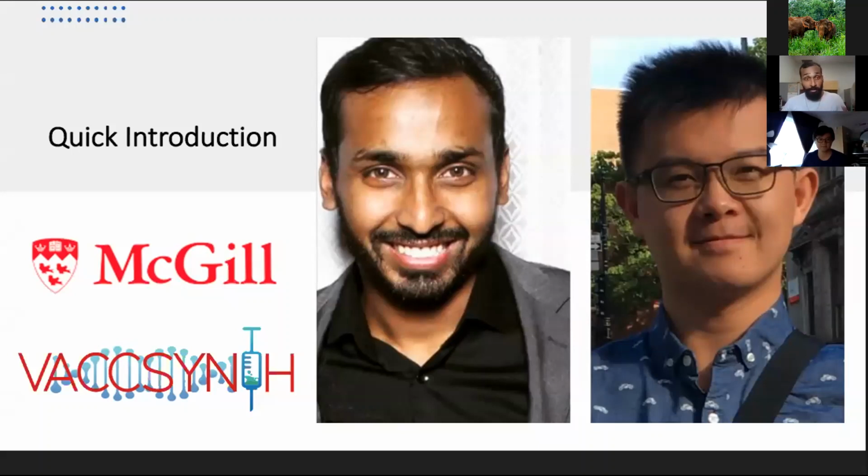Because of both of our backgrounds in cancer biology, there is going to be kind of a cancer theme to the presentation, but the idea is nonetheless the same for any WES or WGS data sets when you're looking for variations from the norm. So those who are interested in cancer, you can literally go home and start looking for your own mutations and make findings right after this workshop with a bit of know-how.